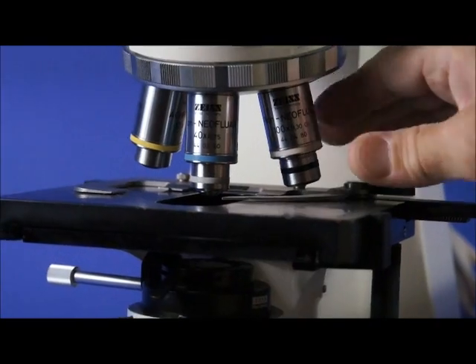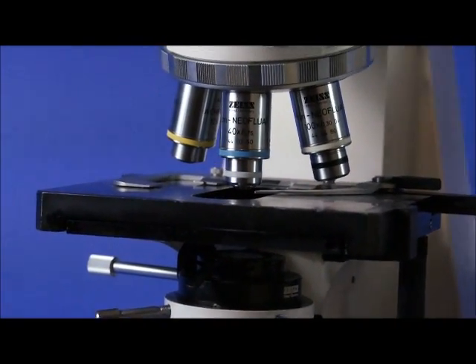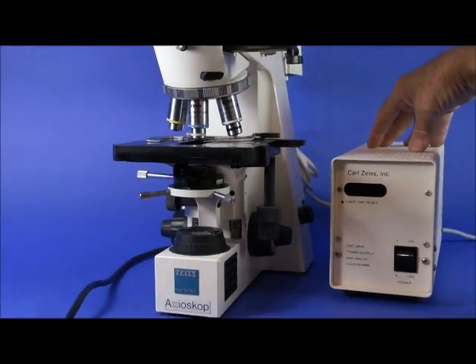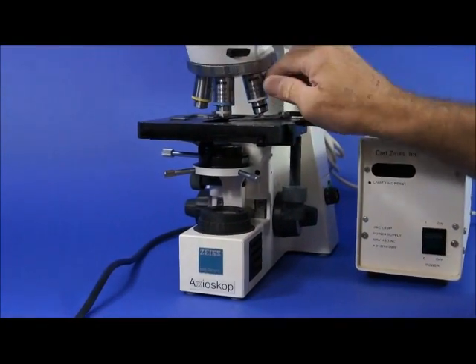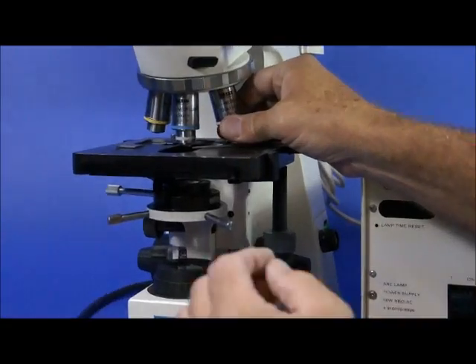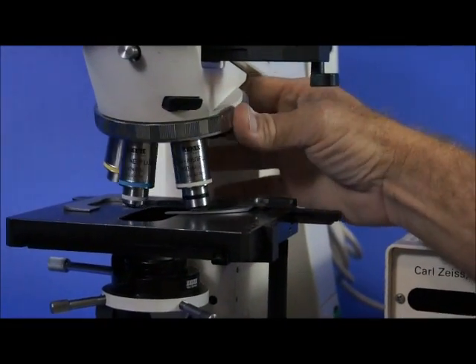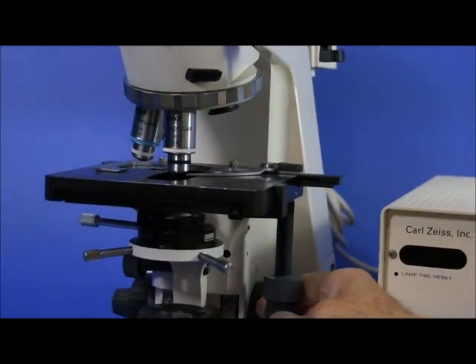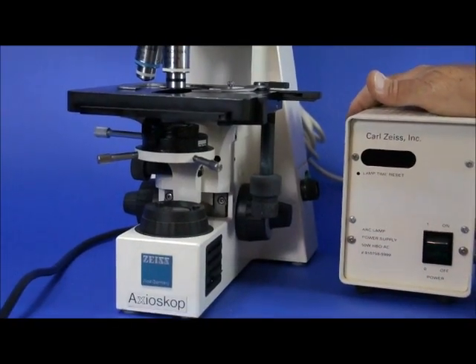And they're especially useful for fluorescence microscopy, which this microscope has a complete 50-watt HBO mercury light source. And so next to the 40X Neofluar is a Plan-Neofluar 100X, and it has a numerical aperture of 1.30 for oil. It's a very high resolution, very high numerical aperture oil objective lens.